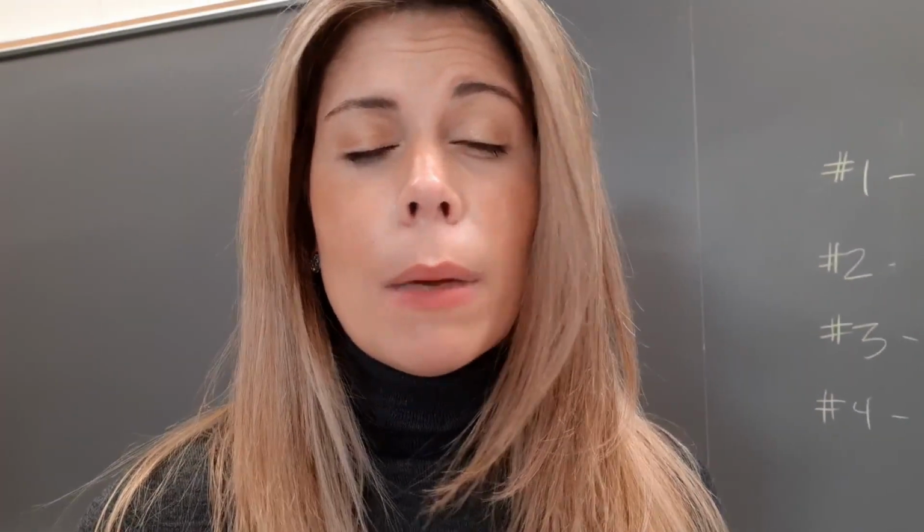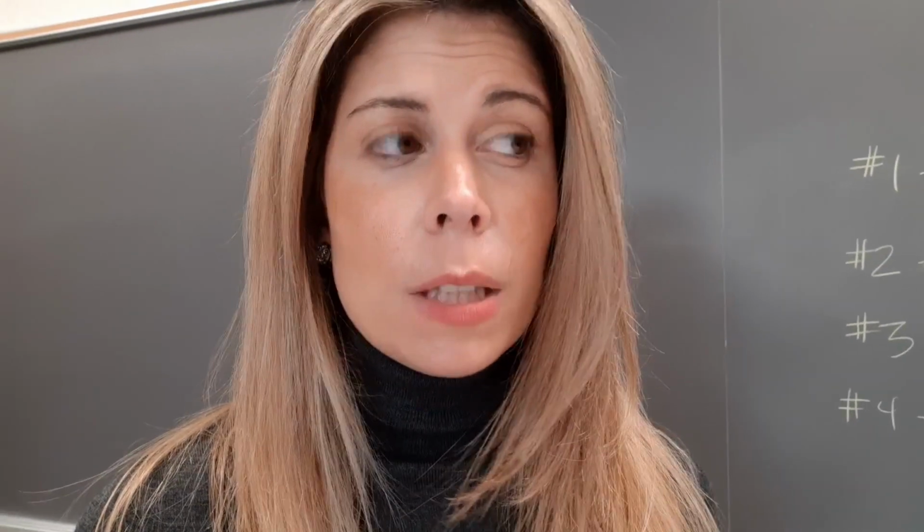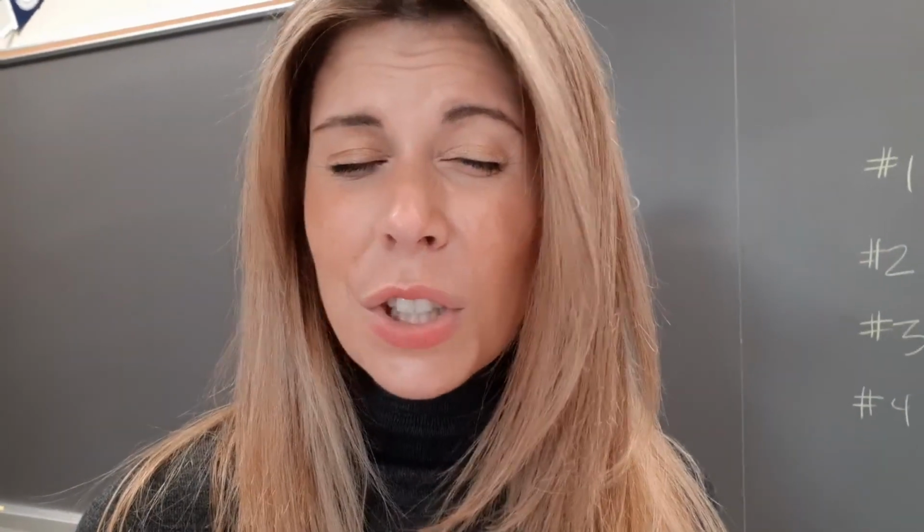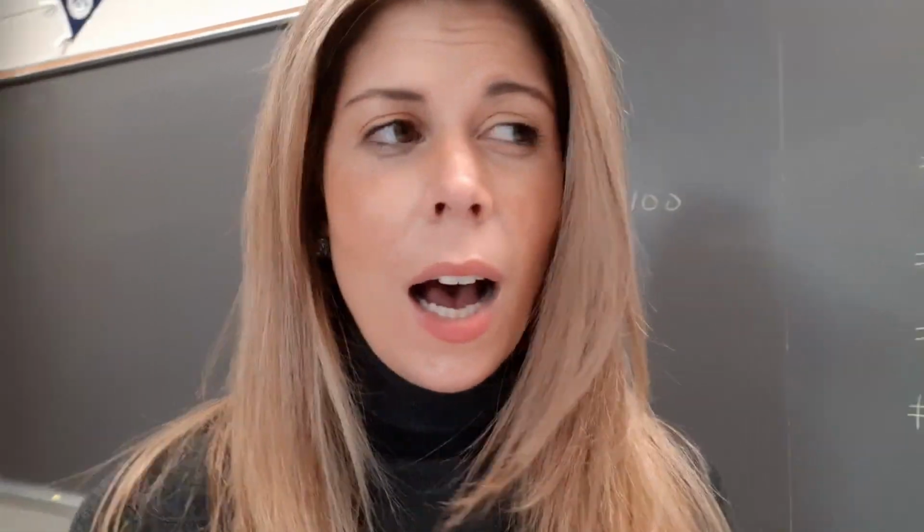One modification that I would make is possibly using a different calorimeter because the students didn't get that good of a set of results. I'm not really sure why that is. I'm using these calorimeters. They look like this. I'll show you. Maybe the heat capacity is such that I should probably factor that into it. I don't know if anybody uses these. They are fine. I thought they would be a little better than a styrofoam cup, which is what I usually use, but their error was kind of high. I'll have to try and figure that out. But overall, like I said, it was a pretty good experience.